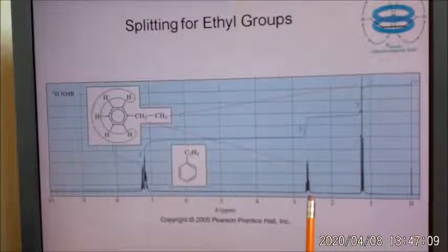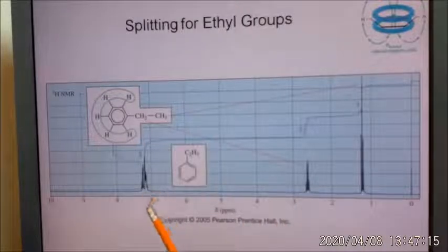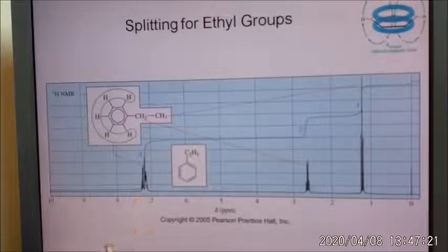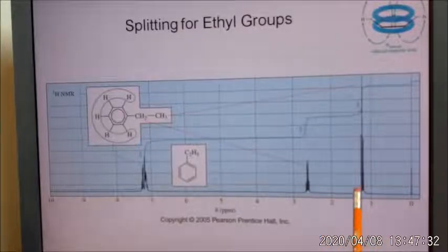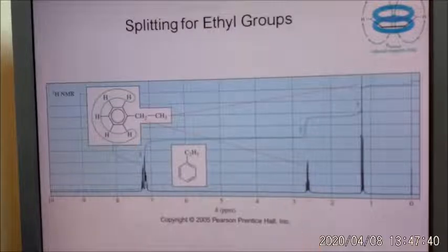We're probably looking at methylene, the CH2 groups here. Okay? And then what about this? Well, 5, it looks pretty messy, but you're in an aromatic range, so you're looking at a benzene ring most likely. Okay? What else can you tell? So we know this has been shifted. If this is CH2, and we know CH2 normally should be in this region, remember that table we showed you earlier? Now look at it, it's way up here at 2.6, right? So what does that mean? Something that's very electronegative or something that's very de-shielding is attached to that CH2 group.